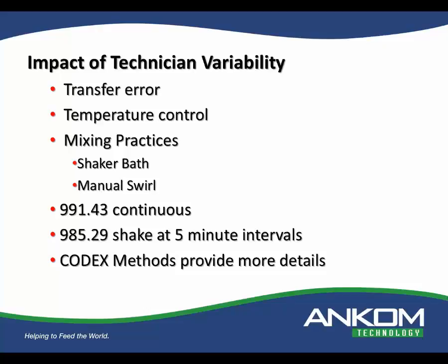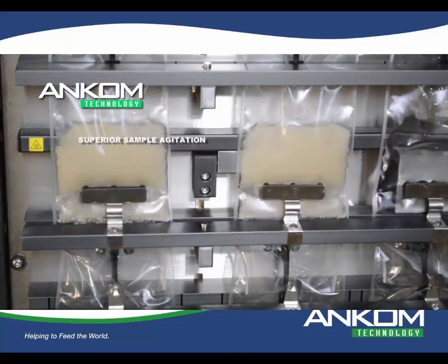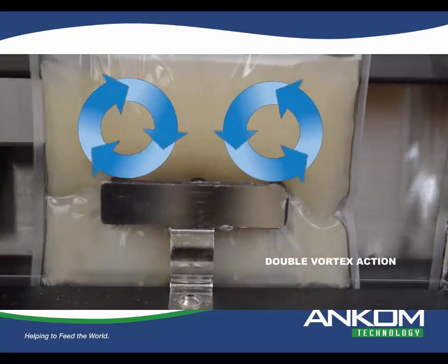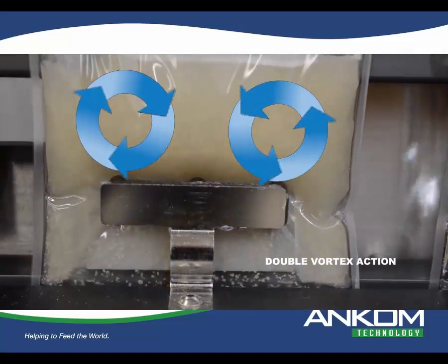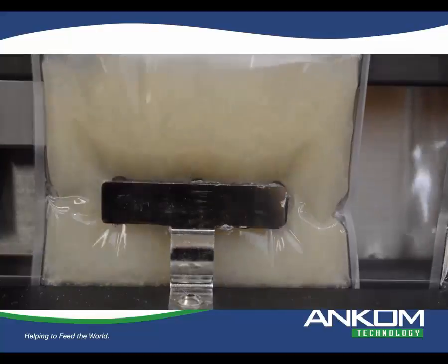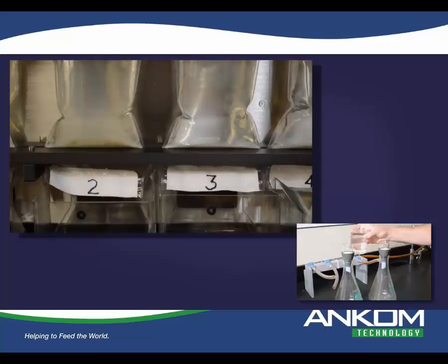And those are the kind of things we look at because we want to make sure agitation is enough to create a nice surface area, a nice flow of the sample within, in this case, the buffer and the enzyme. So that's a critical issue and can have a significant impact on the results based on how the agitation is. When you look at the conventional method as well, there is an issue with filtration.